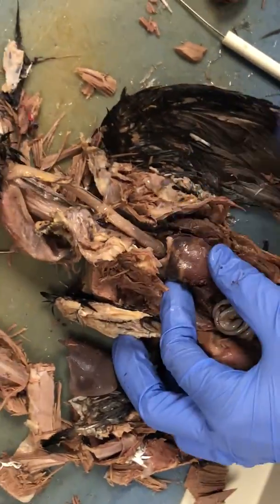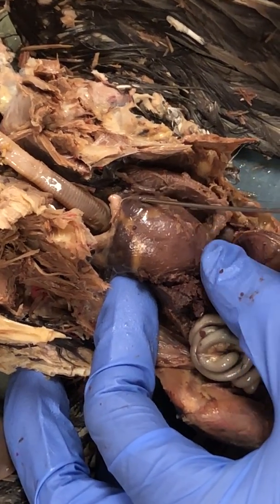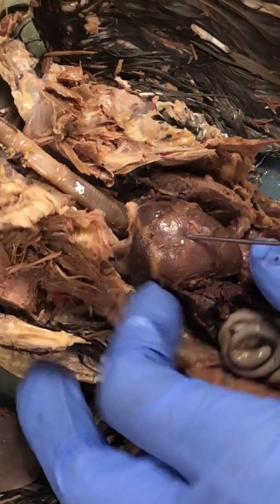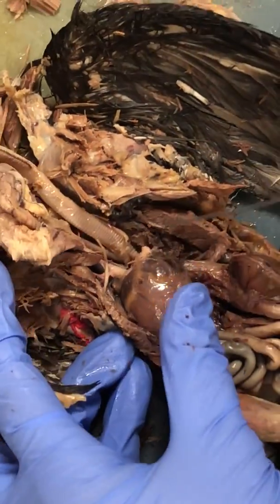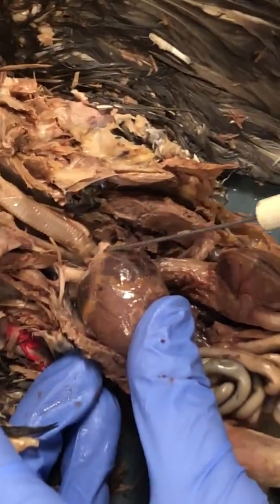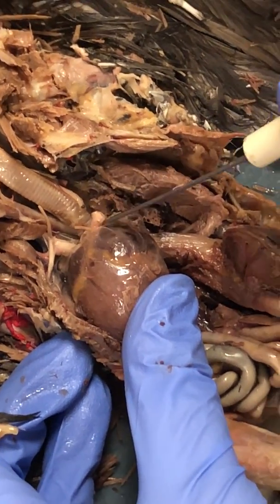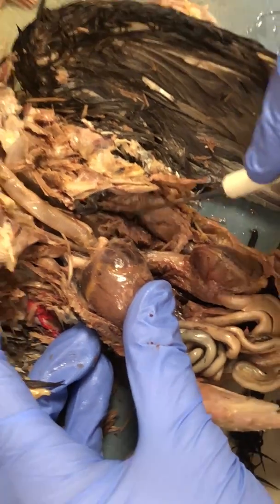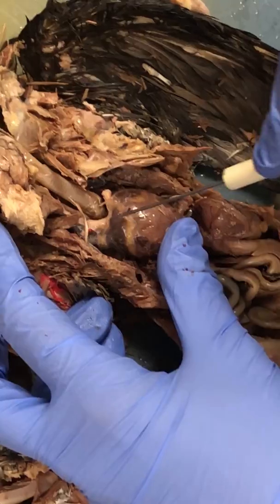This structure right here is the heart. You have your right atrium and your left atrium, and it is divided on the inside into ventricles. Then you have the brachiocephalic region, which should be this part that comes off of it, so they can send blood away from the body up to the head and over to the lungs via the pulmonary artery.